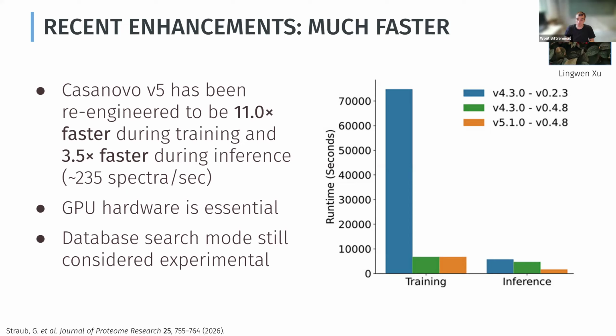The GPU efficiency was also a big factor. So we put some serious software engineering effort into trying to avoid Python. First we were doing some for loops in Python, which was very slow, and then of course we tried to move as many calculations as we could directly on the GPU to do it there.